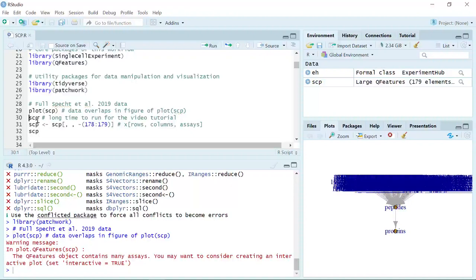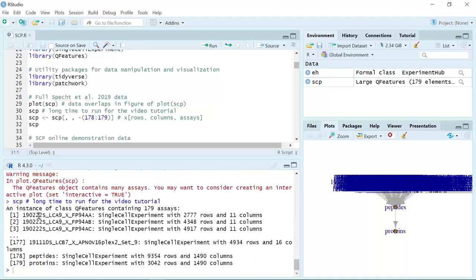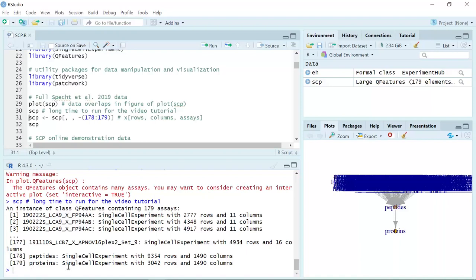We can just run SCP to see the name of each single experiment. You can see here is the list from 1 to 179. So you can see the information for each PSM data inside the QFeatures object. From 1 to 177 are PSM data sets. Number 178 is the peptide data set and 179 is the protein data set. This is because they aggregate the PSM data into peptide data and also aggregate the peptide data into protein data.